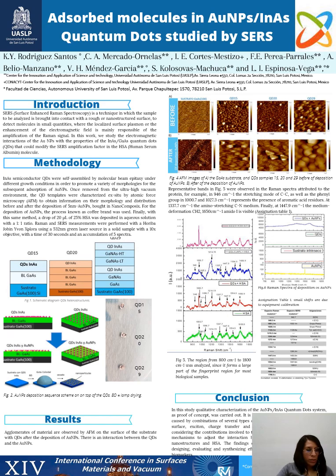The findings of the study open the possibility of designing, evaluating, and synthesizing efficient SERS substrates for the use of biomarkers.